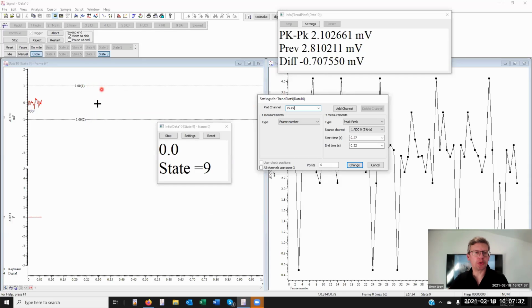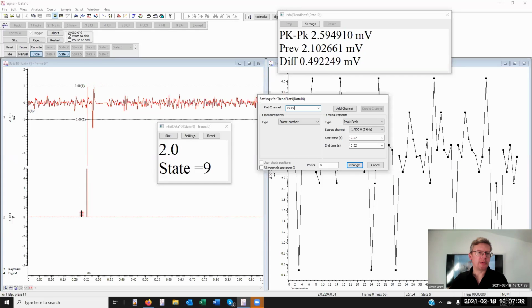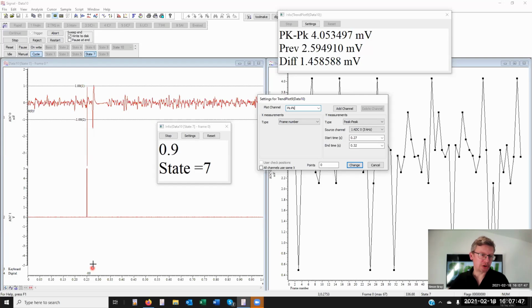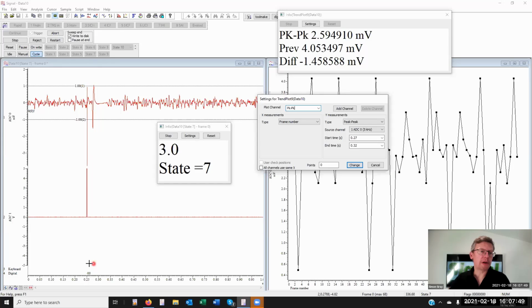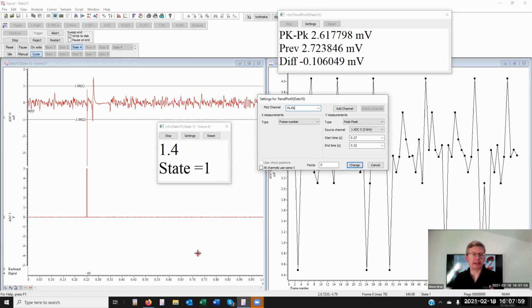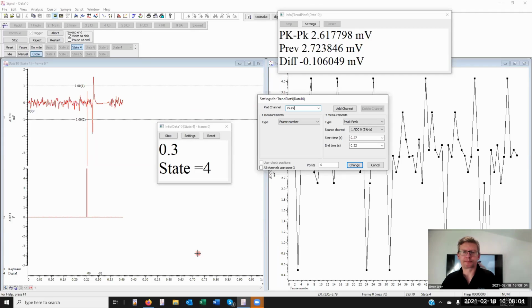Remember, this is pre-recorded. And I'm illustrating the recording in analog form of the digital pulse that may have produced the result here. As well, I should mention a digital marker, which is much more efficient to indicate when that TTL or digital pulse was sent to the stimulator. And you can see I've got multiple markers in this frame to indicate perhaps magnetic, electrical, sound stimulation, all happening at different times.